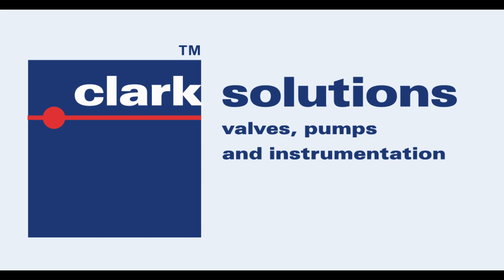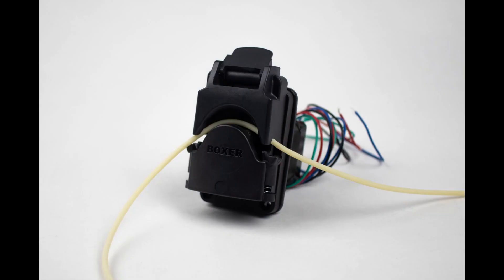Colleen here at Clark Solutions in Hudson, Massachusetts. Today we are going to discuss how to load tubing into a clamp style boxer peristaltic pump.